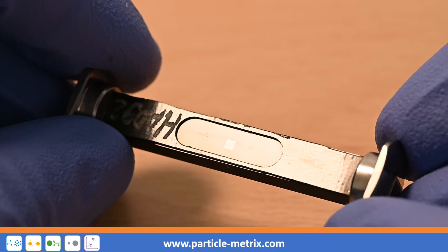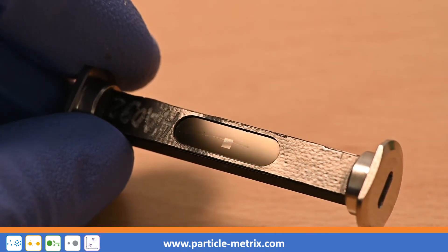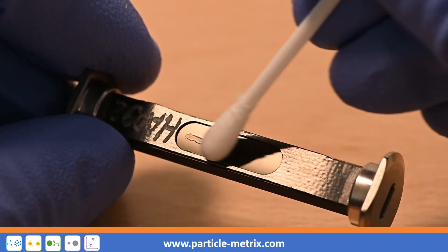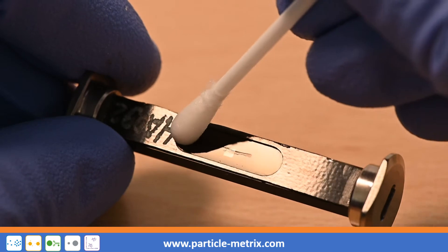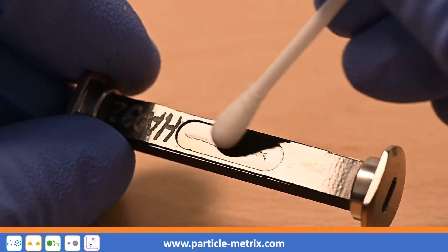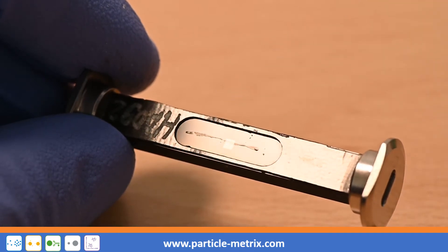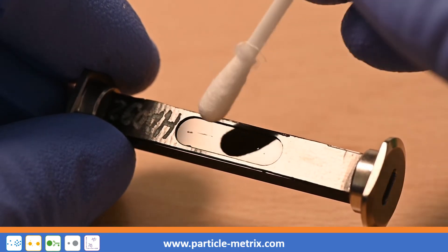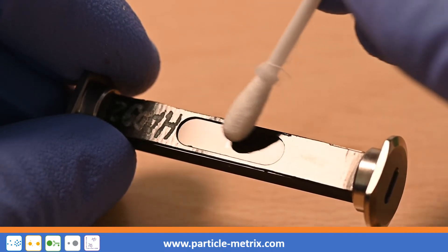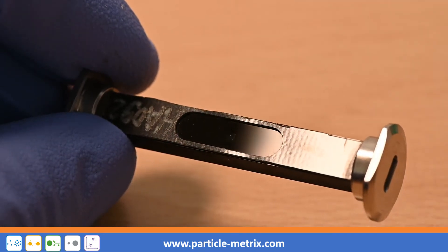If necessary, clean the second optical window in the same way. Be careful not to leave streaks on both optical windows.